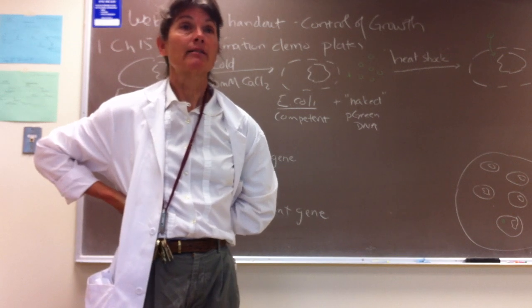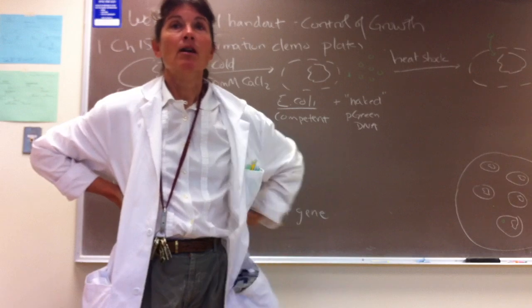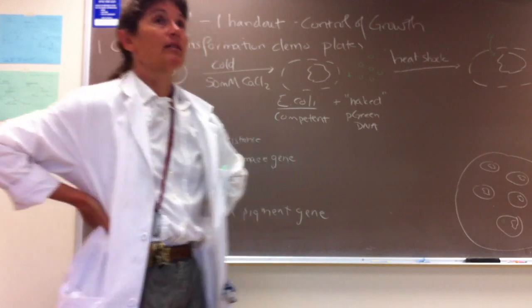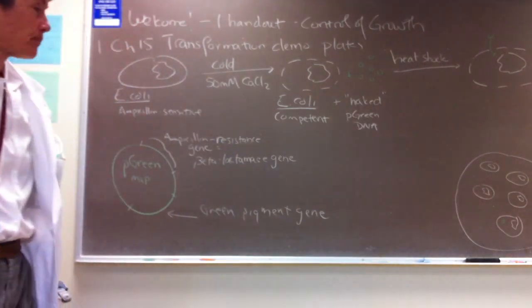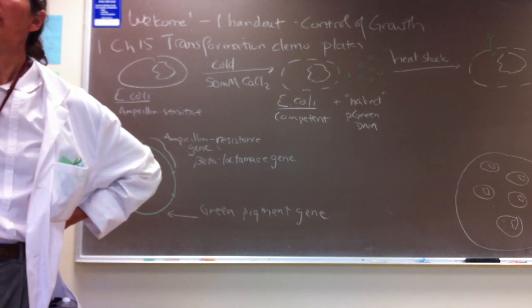Professor Holland kindly did the transformation experiment for us on the weekend. So we've got this incredible transformation experiment described in chapter 15 that we're going to share with you.